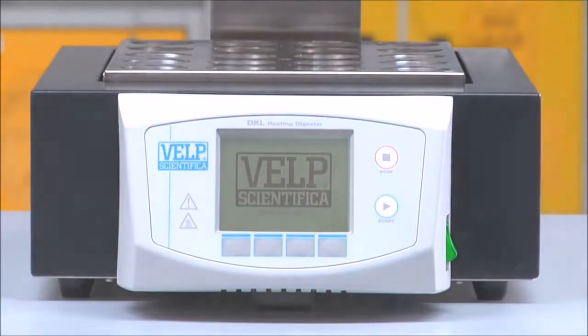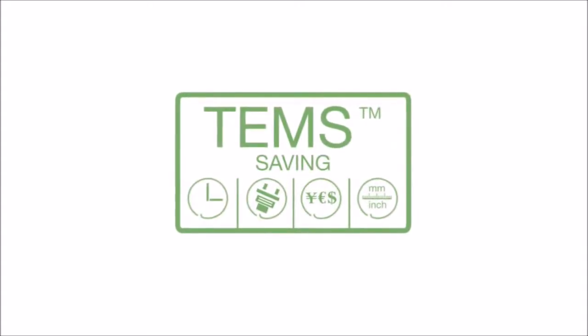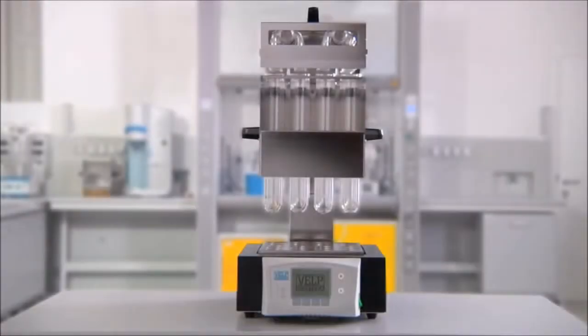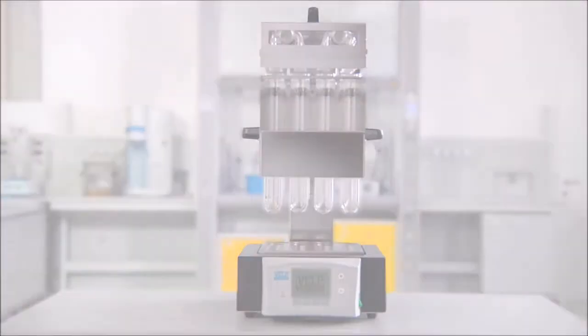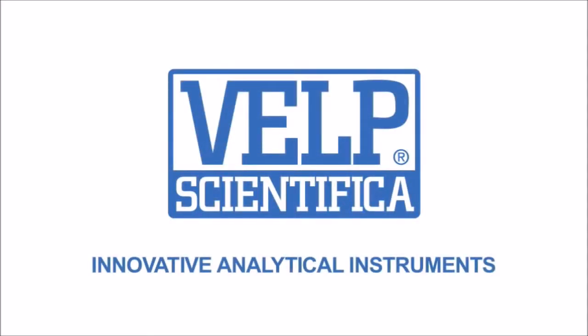DKL series incorporates the exclusive TEMS technology for conspicuous savings in terms of time, energy, money and space. Velp Scientifica Innovative Analytical Instruments.